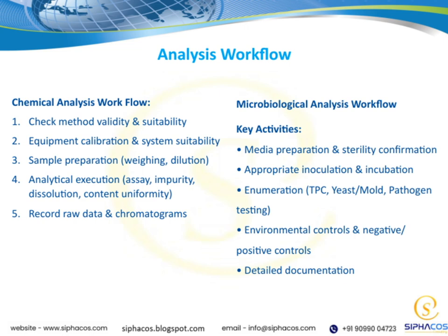Environmental controls and negative or positive controls are crucial to validate that our testing environment is reliable and that our methods are working as expected. Finally, detailed documentation of each step ensures traceability and compliance.